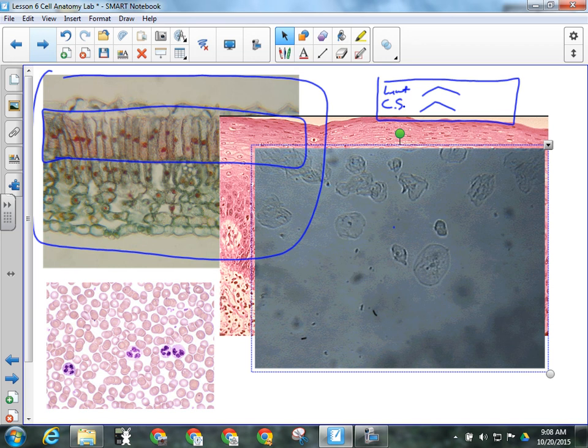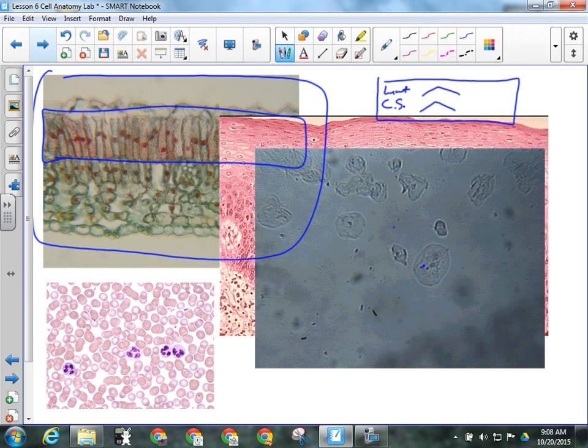Looking for other structures, I would say that we probably have a Golgi right here. You can almost see that it's kind of V-shaped right there, that little thing that I just obliterated with my blue marker. Use your judgment. When you're seeing something, if you think that's what it is, say that's what it is. You're probably right if that's what you think. I would suggest taking your cell diagrams across with you so you can compare back and forth. Questions there? Okay, so that's what we're looking at procedure-wise.